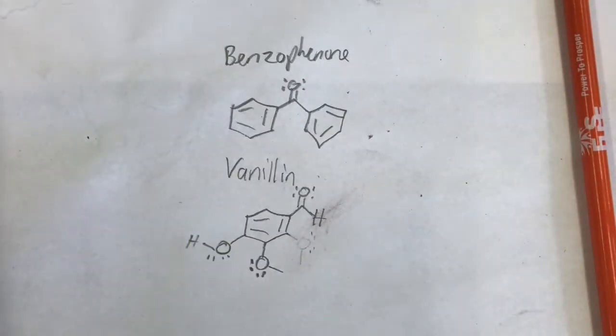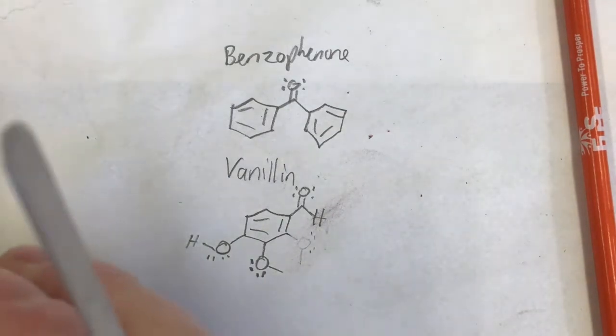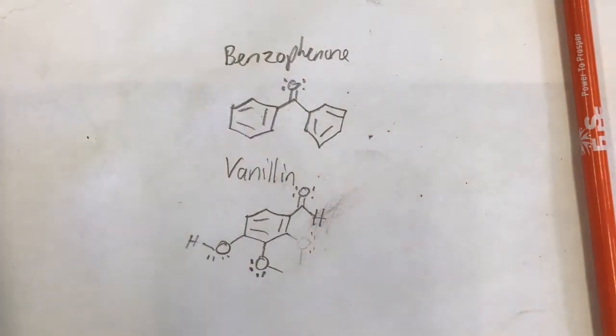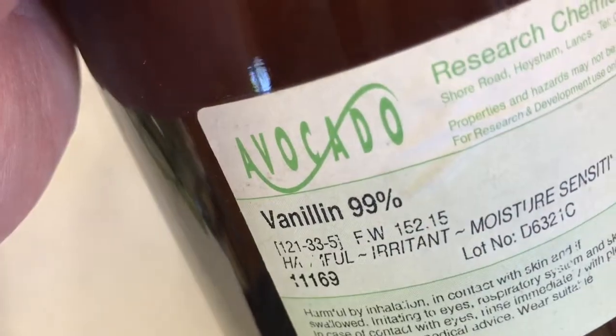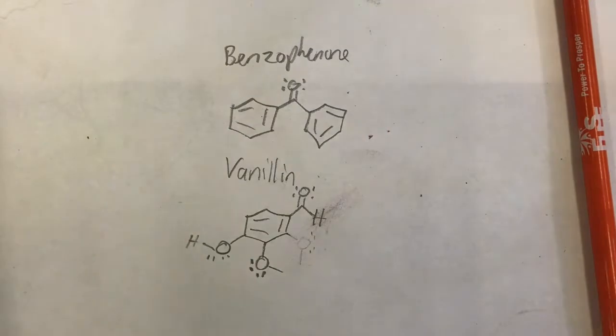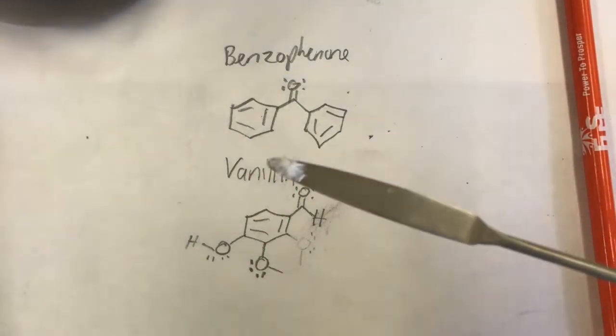TLC is great, like I said before. You barely need any sample. If it's something precious that you don't want to waste, then it's perfect. You don't need much to use. Okay, so now a little bit of the vanillin. Chillin' with vanillin. Nice white crystalline compound.